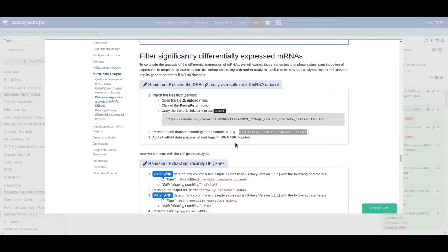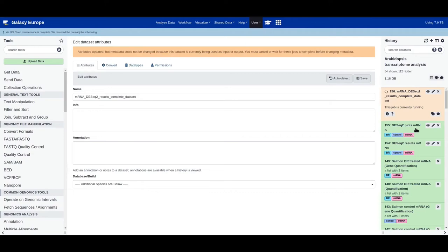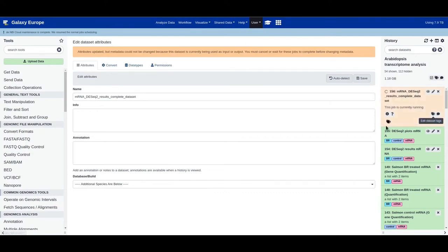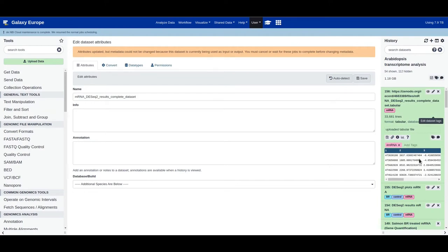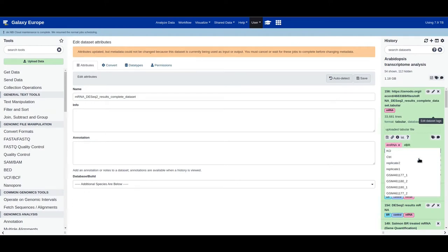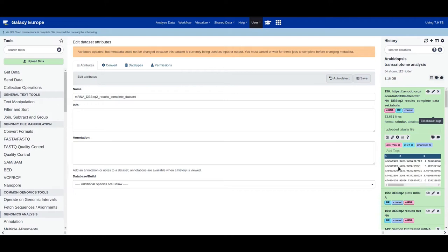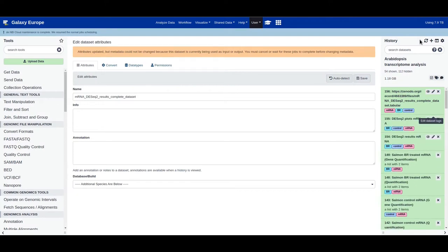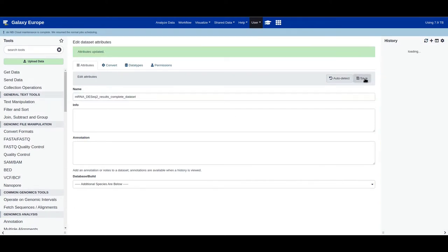Let's save it, then add all the tags related to the mRNA data analysis: add 'mRNA', 'BR', and 'control'. Save it again.